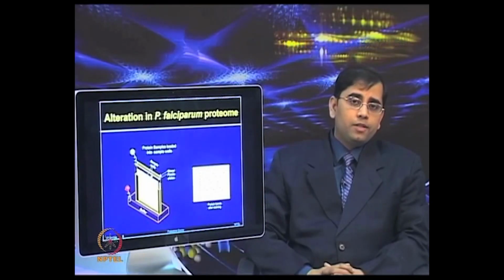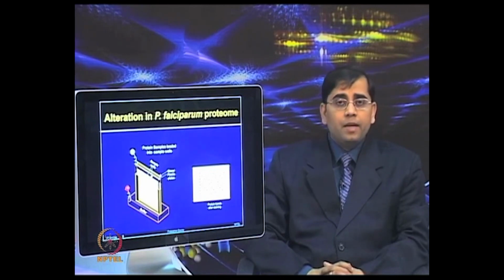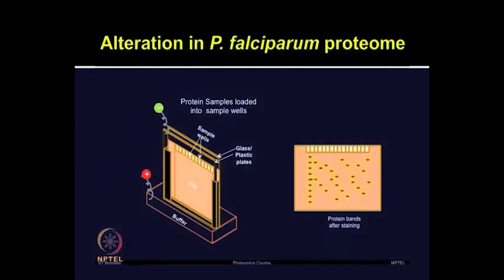Once protein extraction was done, the authors used an IPG strip of pH 3 to 10 range for the first dimension separation of proteins in the linear IPG strips. After the IEF was done, they equilibrated these IPG strips and then applied them on a 12.5% vertical SDS gel.